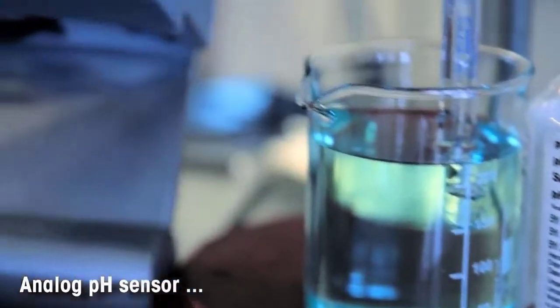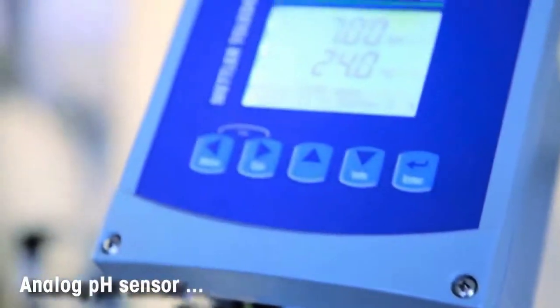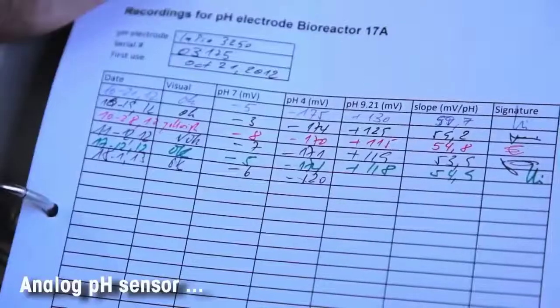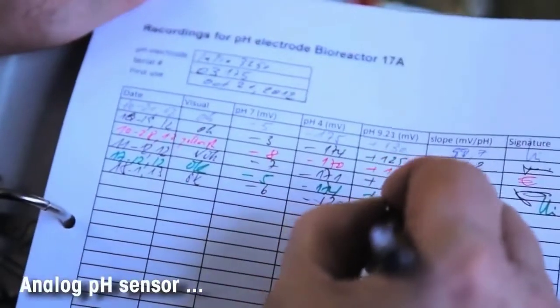Calibration of an analog pH sensor must be performed directly with the transmitter. After calibration, you must document the new data in your records.